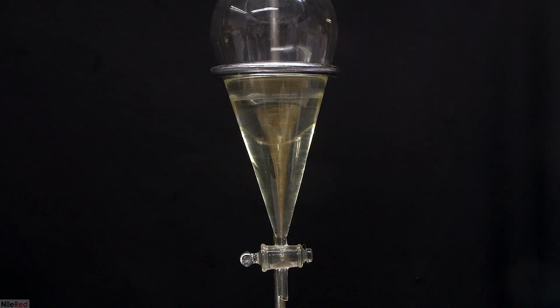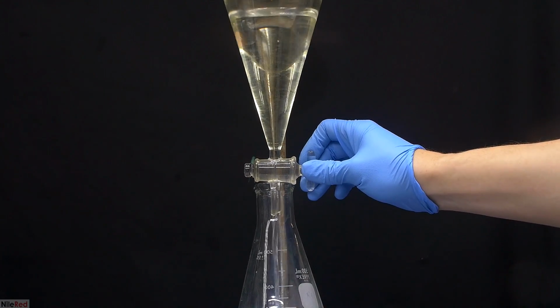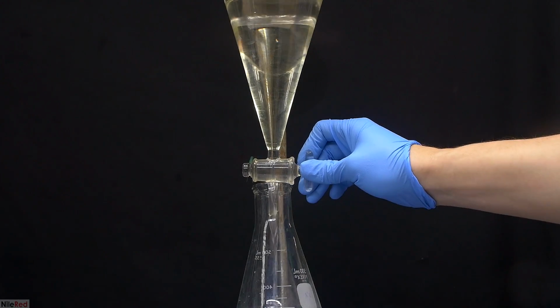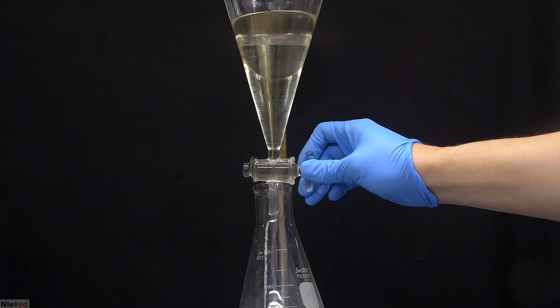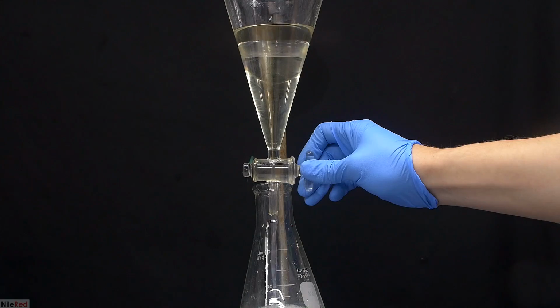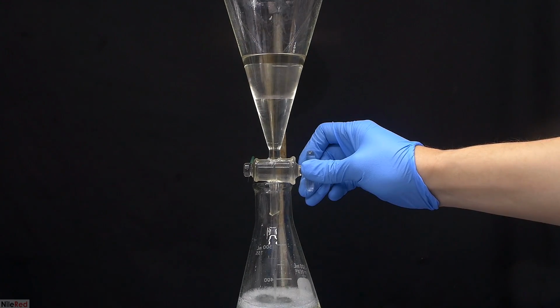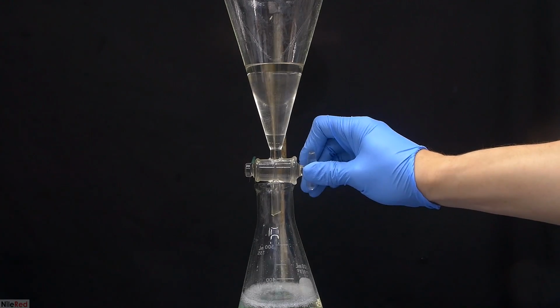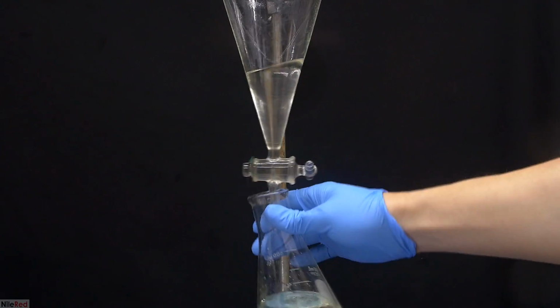I come back a little while later and there's no bubbling, so we're ready to separate the layers. I place an Erlenmeyer flask below the separatory funnel and I drain off the aqueous layer. The upper layer is the ether layer that contains the majority of our caproic acid, and we're going to transfer this to a separate container. The angle that I chose to use here was a little weird, so at the end it looks like there's 3 layers, but I can assure you that there was only 2.